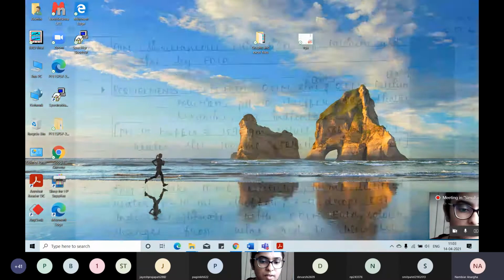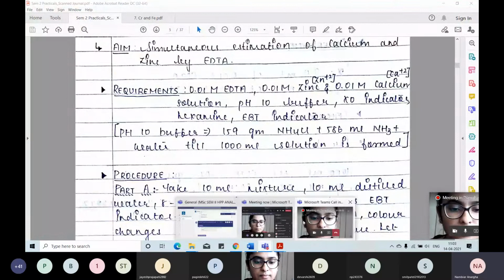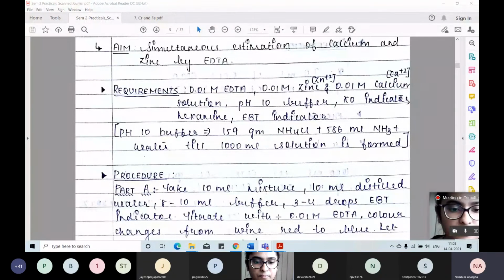Yes, yes. I was saying Nikhil was having one more question. Did you hear that? Which question? The one he was asking right now, which complex will liberate first? Yes, calcium will liberate first. You gave the answer, but it got stuck in between. I gave the answer. Okay.